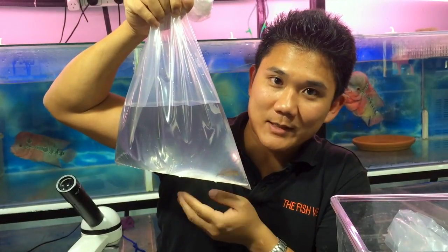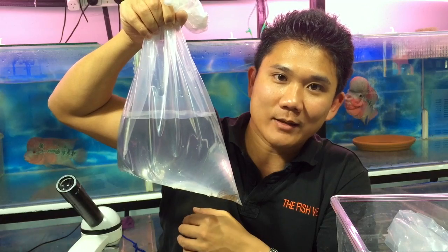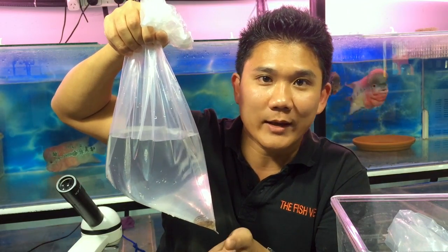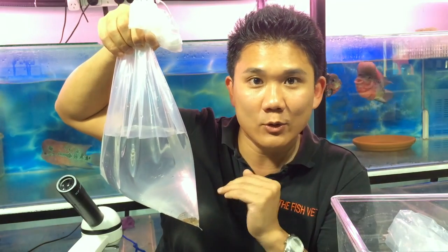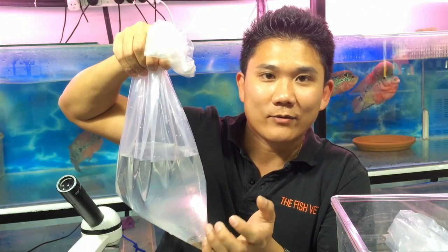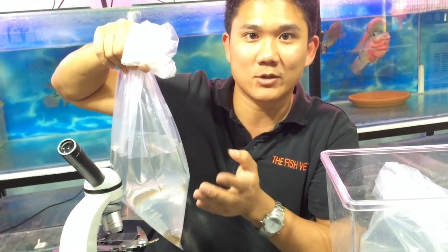So these are the Goldspot Gibiceps that we were examining the stool samples of. We saw some oval shaped things, and I'm thinking they're likely going to be worm eggs. But pollen and other structures can also look similar to that. So to definitively tell what they are, you can actually send them to an aquatic official parasitologist. Or you could centrifuge or spin it down, create a pellet, and once we get a cross section I'll be able to identify the structures inside. With eggs, it should have vitelline material. With pollen, you'll see more of a plant-type lattice structure.